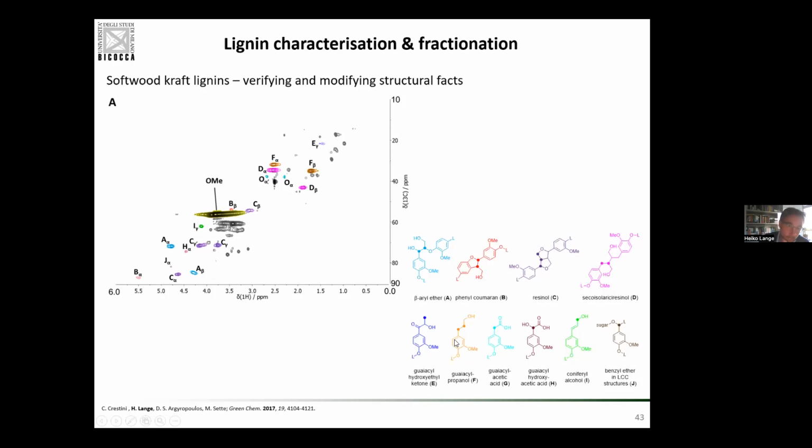The lignin chain, the lignin polymer, the lignin oligomer does not always end up, obviously, in a phenol, right? We can end up in a saturated one, in a cinnamyl derivative, or where we lost the double bond, for example, or we end up in an acid, or we end up with a typical cinnamyl type of motif, etc. All this makes a difference if I think of a valorization, because this is an active aspect, a reactive part. This is a non-reactive part, so I need to know.